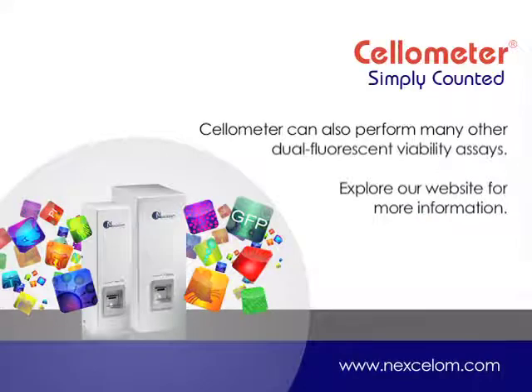Cellometer can also perform many other dual-fluorescent viability assays. Explore our website at NexCelom.com for more information.